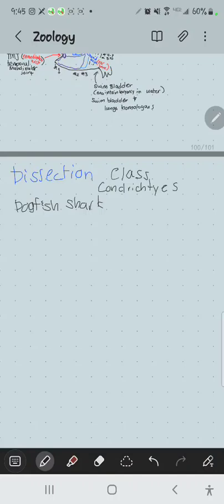Not all sharks have 5 gill slits. Some have 6, and I think a couple species might have 7, but 6-gilled sharks are more common. 5-gilled sharks are the most common. 5 gills because the first 2 gills are being used for chewing. But there is a structure above the eye called a spiracle that is a remnant of the second gill slit.